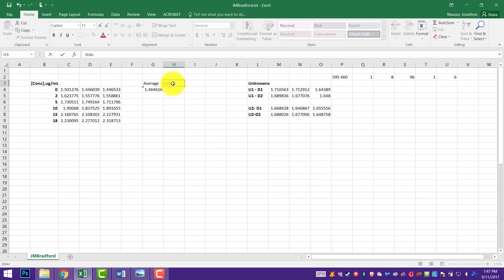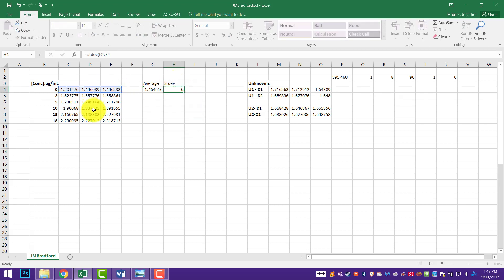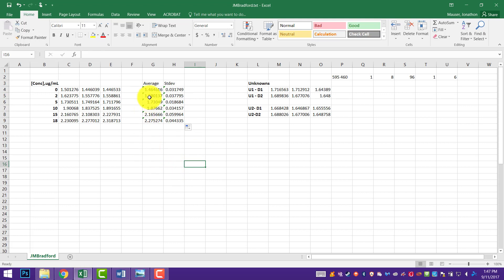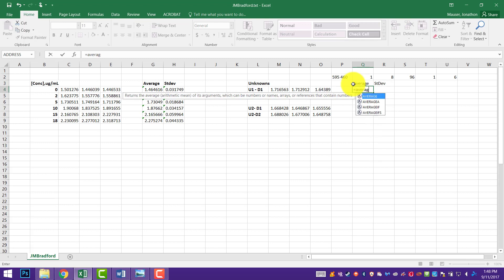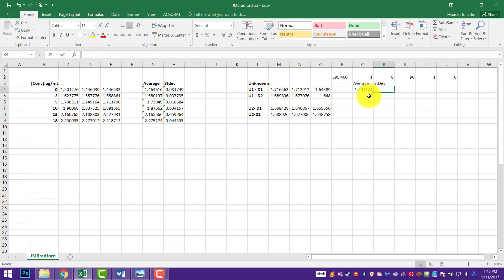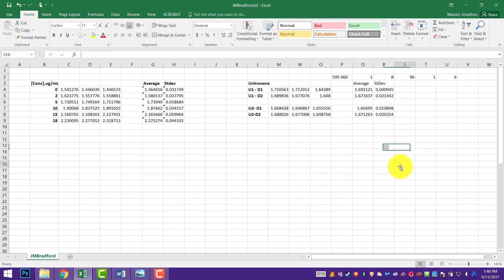I also need to do the standard deviation — equals STDEV, draw across. I'll drag those down to fill. That looks good. So we have our average and standard deviation of our standards. I'll also want to do that for our unknowns: equals average, and equals STDEV. Then I'll drag this all the way down. There's going to be an error in the middle — I'll just clear that out.